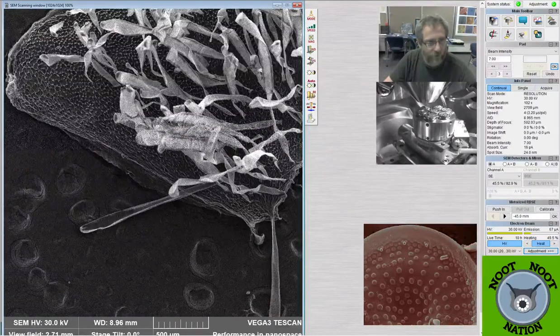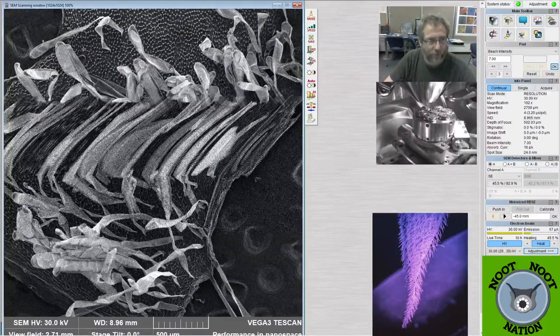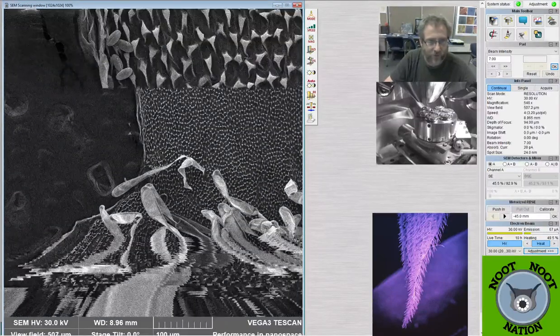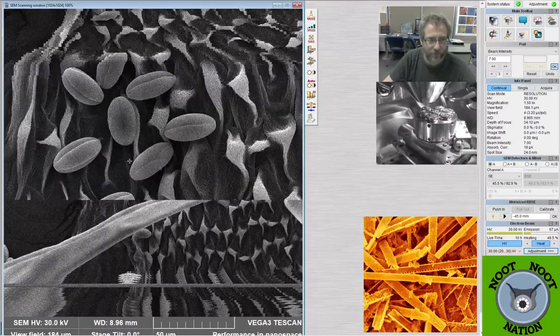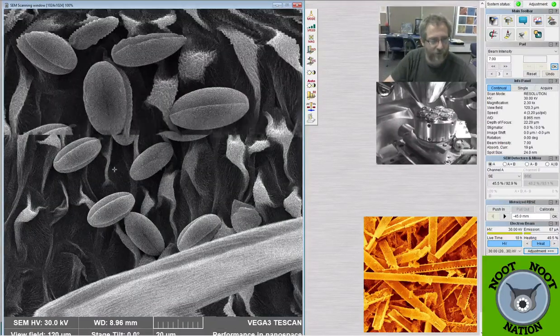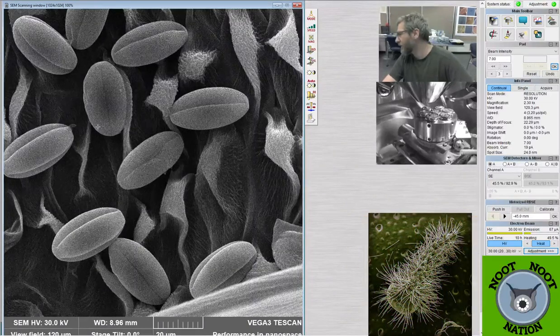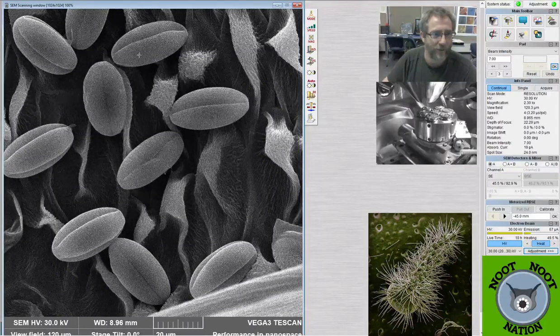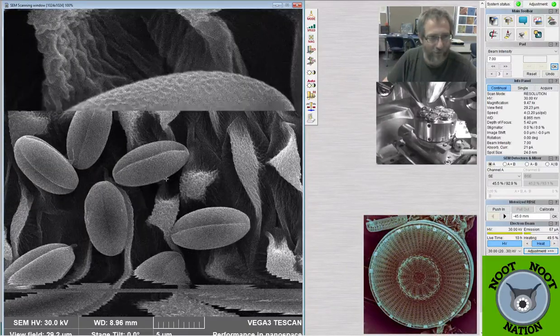And then you can see this is the actual petal itself. And as I mentioned, there are some clusters of actual pollen in here. You can see them, there's some right here along this edge. They're not the same as the previous one, but they're all the same as each other, basically. And so I think that's a good indication that they are all the violet pollen. I guess one small caveat is I brought them in a bag with a bunch of other plants, so it's possible that I smashed some of them together, and a little cluster might have fallen off of one and landed on this.